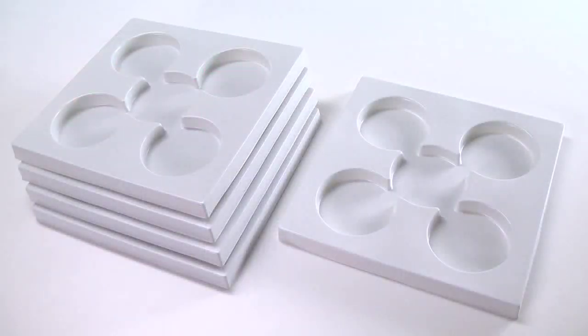Behavior studies can be facilitated with the animal behavior trays. The central compartment acts as the starting point for the organisms under study, surrounded by four test chambers available for different attractant and repellent substances.